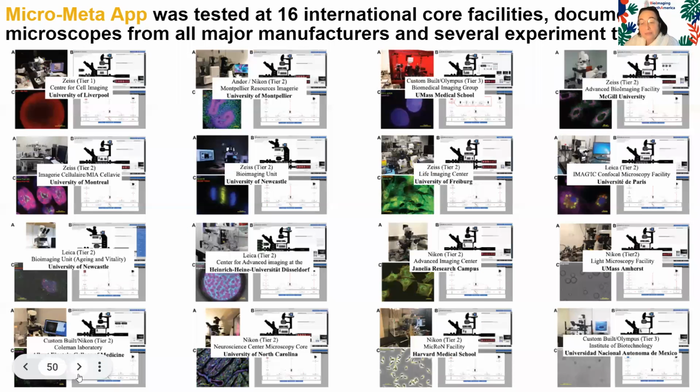Okay, next, please. So this tool was already tested at 16 different facilities, and we have sample metadata files available on Zenodo for you to take a look at and play around with and see how they can help document different types of experiments and different experiment modalities.